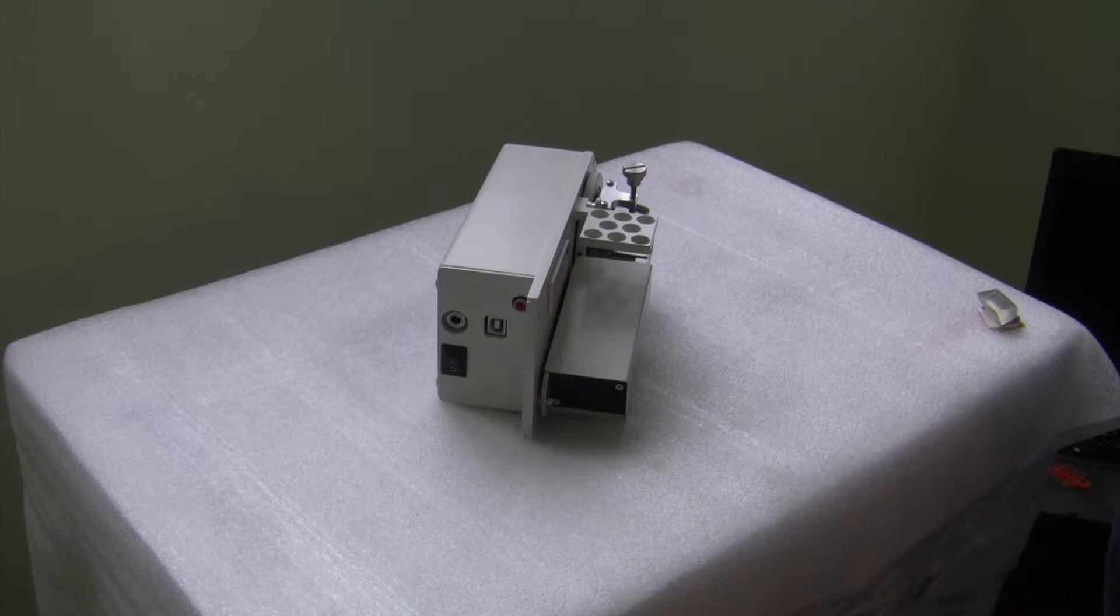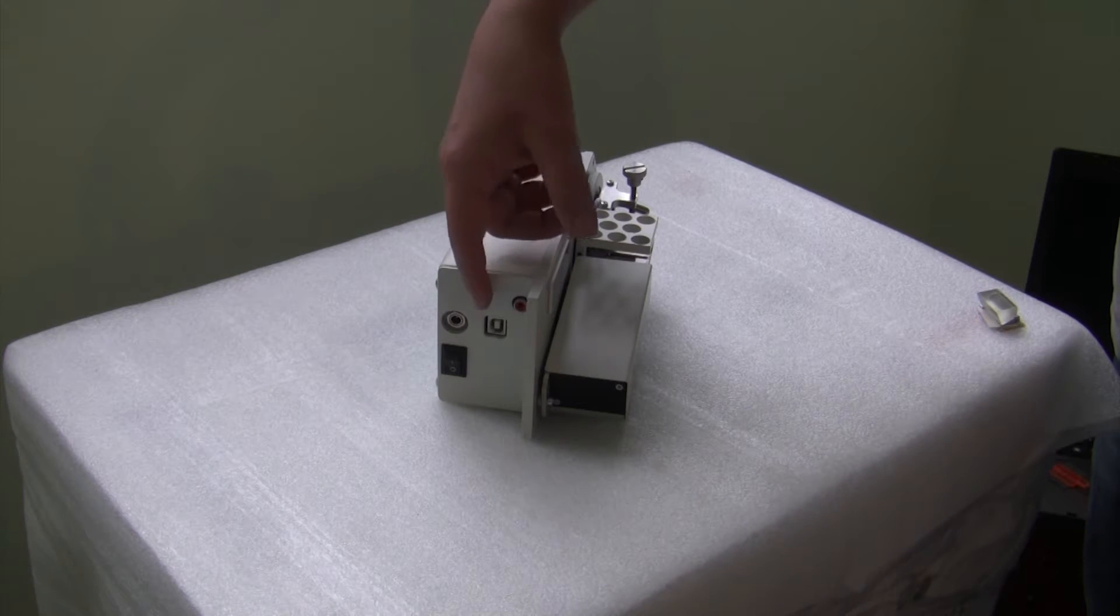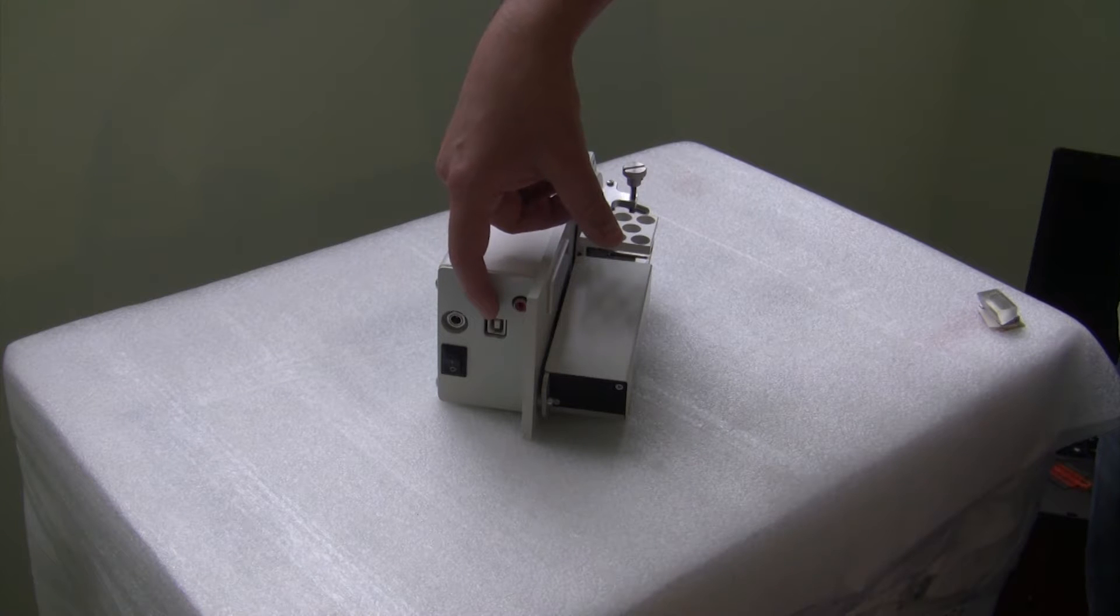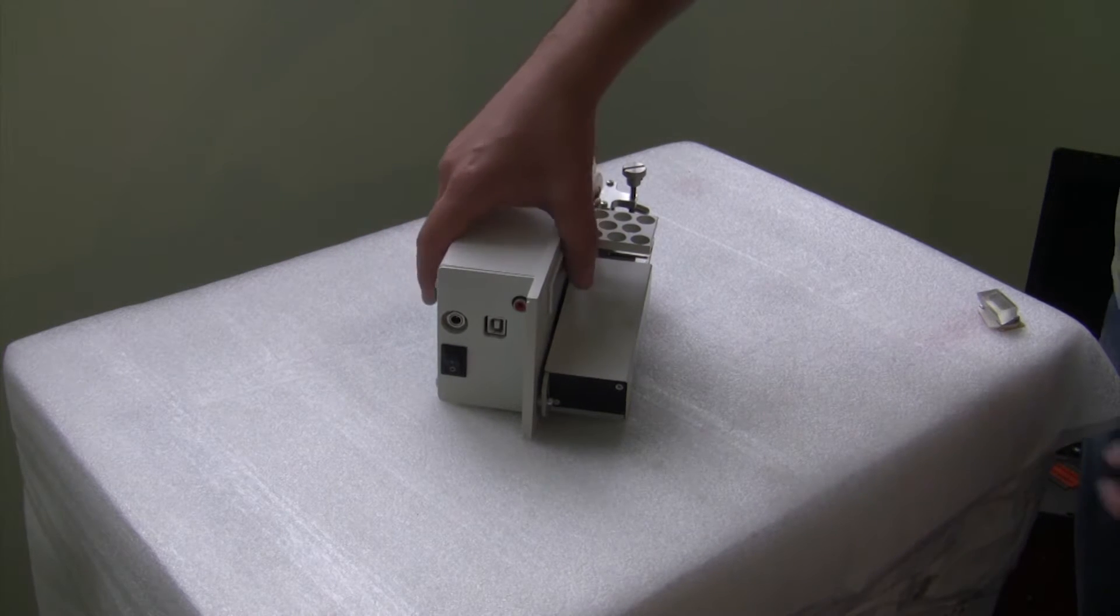Also, the device is able to show a full SPR curve during measurements, simple setup with connection to the computer via USB port, and ability to measure and overlay signal from external source.